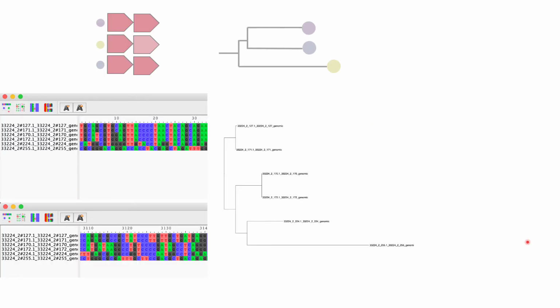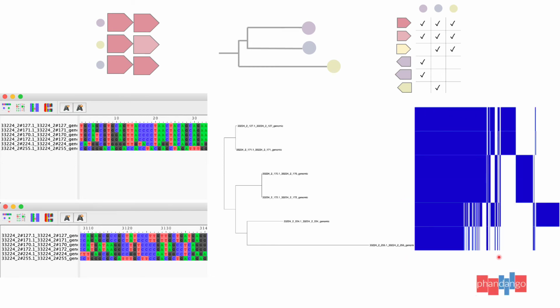And so what this actually would look like, the final piece of this puzzle, is the gene presence-absence matrix. And again, just to remind you, I'm using a schematic. And if we put this against the tree to contextualize the patterns of shared and unique genes, or core and accessory genes, I'll add in the real life version. So basically, a lot of blue and white. Blue being for presence of a gene and white being for absence of a gene.